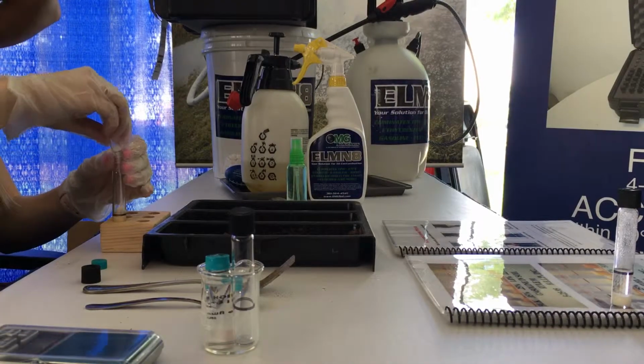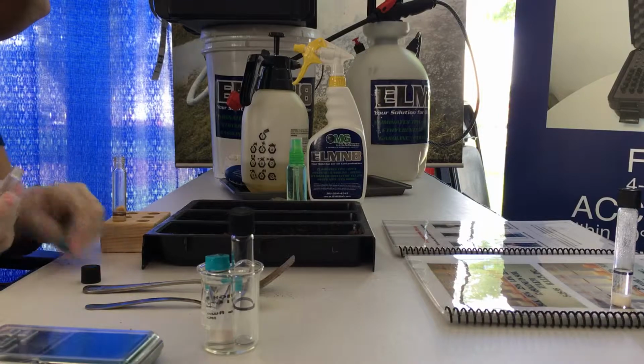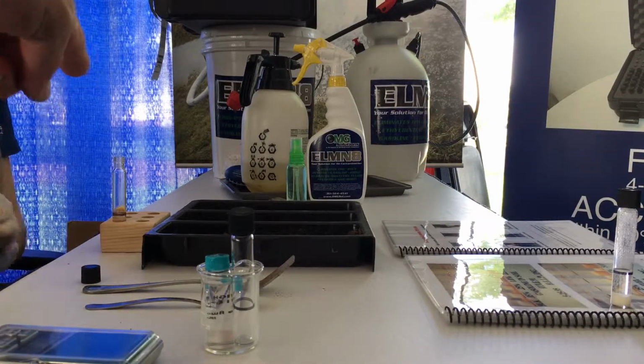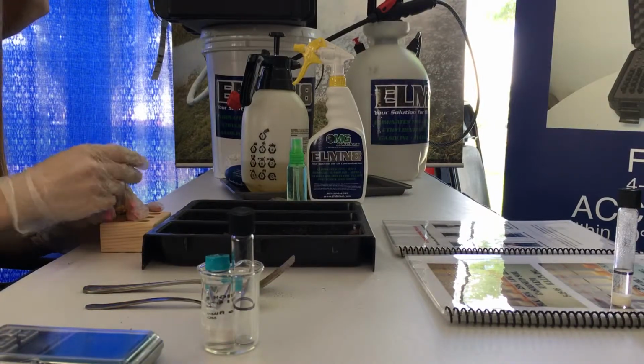All right, so again, now adding that color development reagent catalyst to our extract, and notice, I hadn't even shaken it yet, it's already discolored. That's how fast the chemistry works. Now we're going to shake it up and find out how contaminated we are.